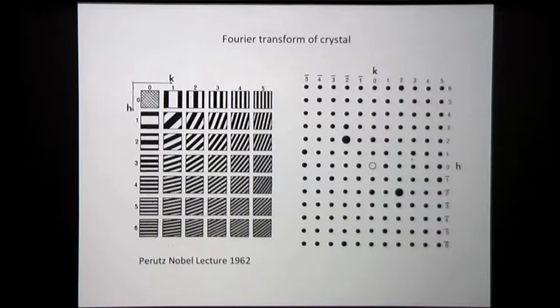So you can think of the unit cell here, which is just one of these little squares, being analysed in terms of these sets of waves in different directions and of different wavelengths or frequencies, so that these adding up would build the density in the unit cell.